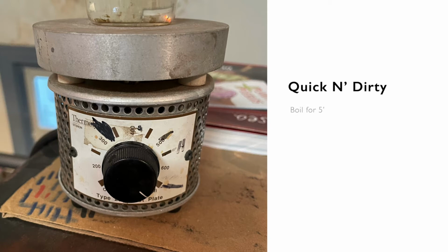So you will boil them for about 5 minutes until you see that if you put a head in the beaker, the head starts to sink in the beaker. Then you will put your samples into diluted sodium hypochlorite. That is a clearing agent. Then you're going to wash it in water, and later on you could add a dye to enhance the contrast.